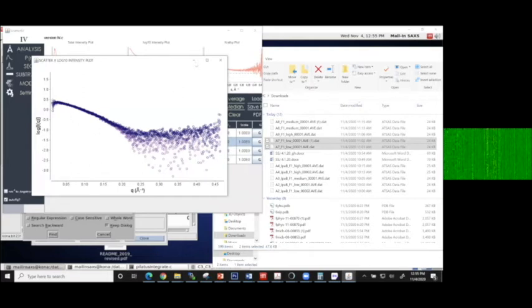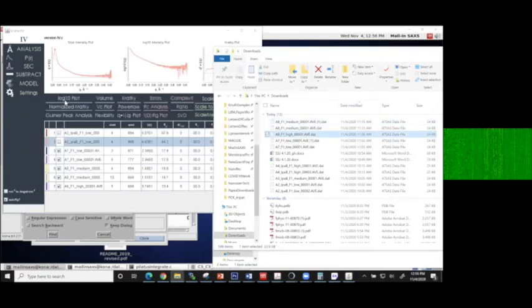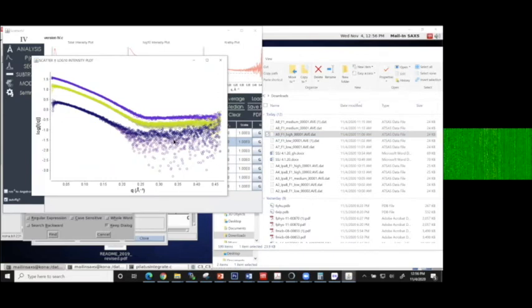I'm also going to pull down the concentration series. So they did a concentration series, a low concentration, a medium concentration, and a high concentration. So let's pull those guys down. And I've just done the same thing with the frame slice tool. Log 10. And so there's the 3 curves of protein 1 at different concentrations. The lowest concentration is the noisiest, obviously.